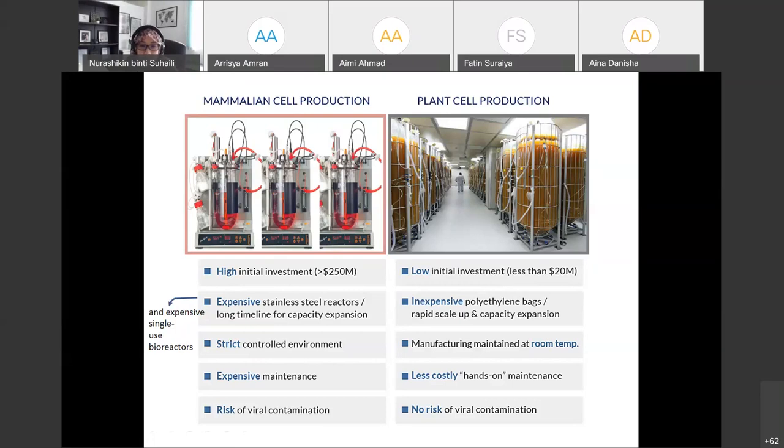Just to share the cost with you, I used Micro-24. It looks like a cassette. A cassette has many small reactors. So the whole cassette, including the caps, costs, it did not cost me, it cost my supervisor £300. £300 every single run, every experiment, £300.